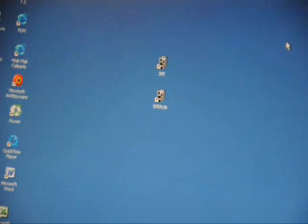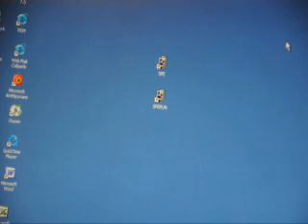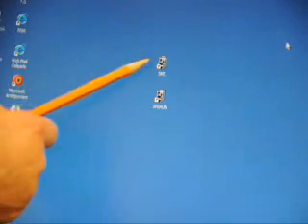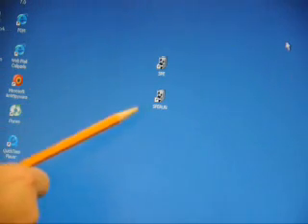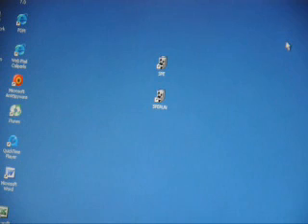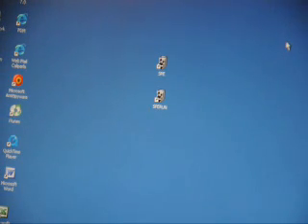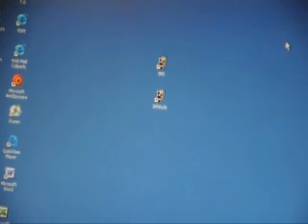Right now, we're going to go into the software and we're going to start a method running. And on the screen, you'll see there's two different icons. One is called SPE and one is called SPE Run. These two icons are for different executables.